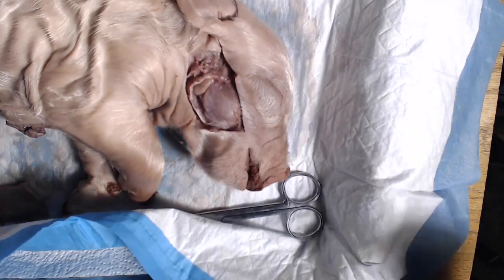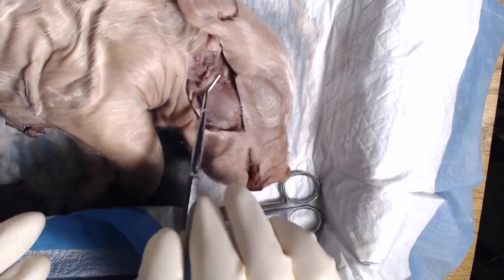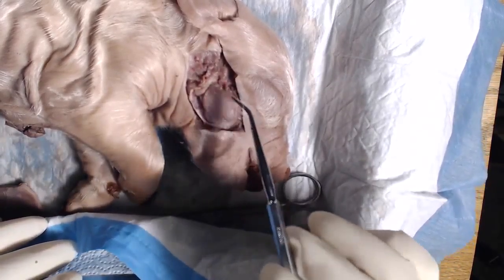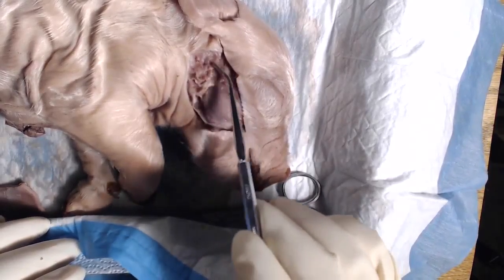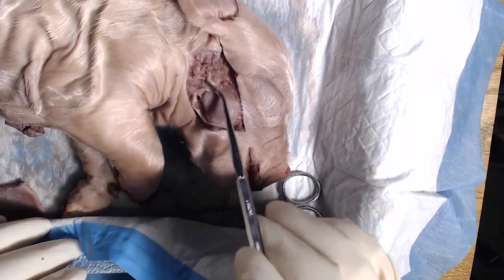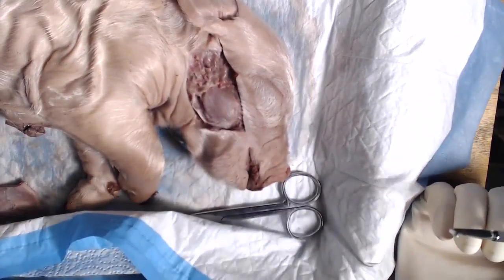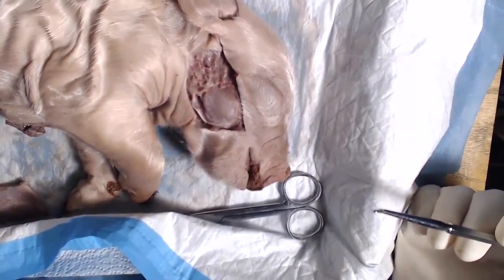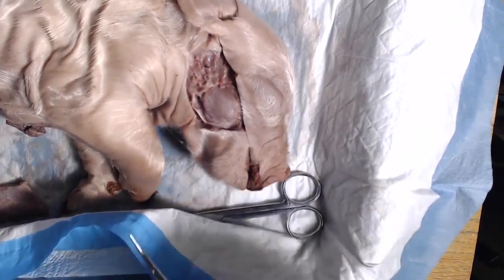All right, so just another review real quick. At this point, once you have your skin off, the main thing you're going to see is your masseter here, this big round muscle. And then directly behind it, you should see your parotid gland. It's this thin, spongy looking tissue. Now you shouldn't have to cut through the muscle at all yet. We will be doing that shortly, but just to see the muscle and the glands, you don't need to cut through the muscle yet, just the skin.